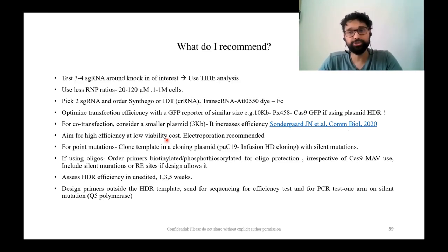My only issue with that technique is whether you can couple it with a reporter technique with high enough efficiency, such that you can have a readout downstream. Nevertheless, if you really optimize the design in a way that you optimize the viability and the efficiency, I think it's a good strategy to try out, because it's pretty clean. But I don't have much experience with that.